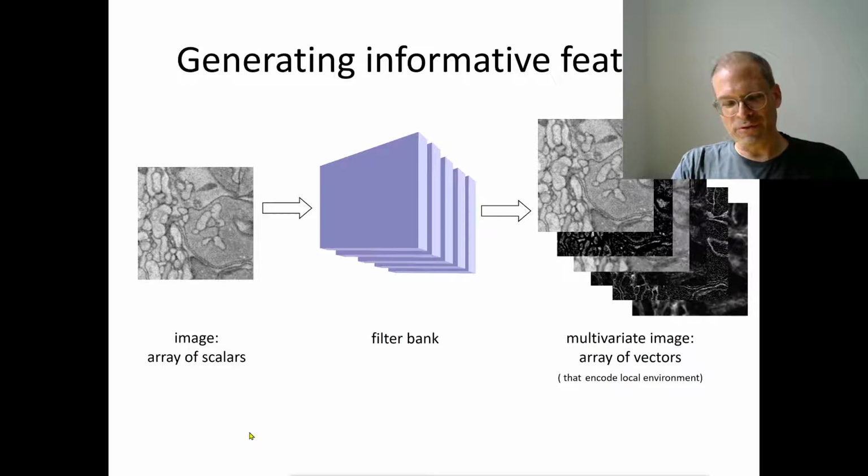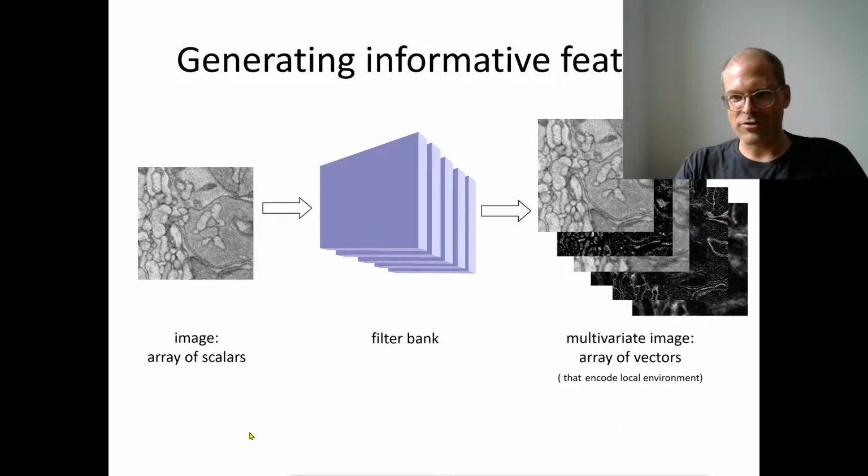One of the beauties of deep learning is that we can learn which features are useful. However, even the use of deep neural nets still requires a bit of experience these days, and what this community is trying to do is to make it simpler and simpler for the person, so to make less and less experience required in order to successfully train a machine learning method here.